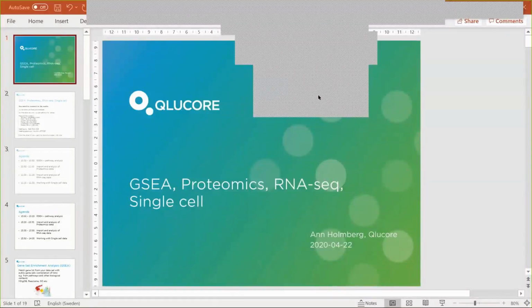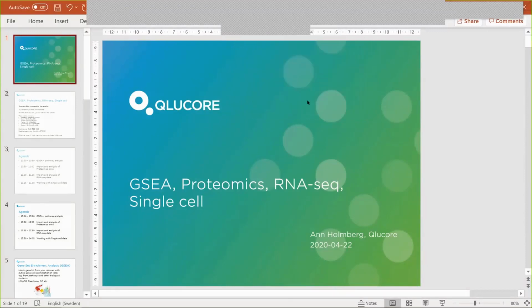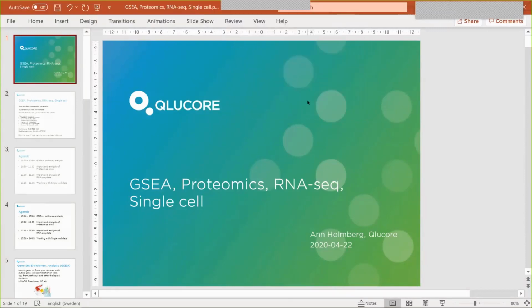Okay, then I would like to welcome you all to this around 1 hour webinar where we talk about Gene Set Enrichment Analysis, how to analyze different types of data: proteomics, RNAseq, and single cell. And as you know, this is a demo today, not a hands-on exercise, and I will send out the slides after this session.